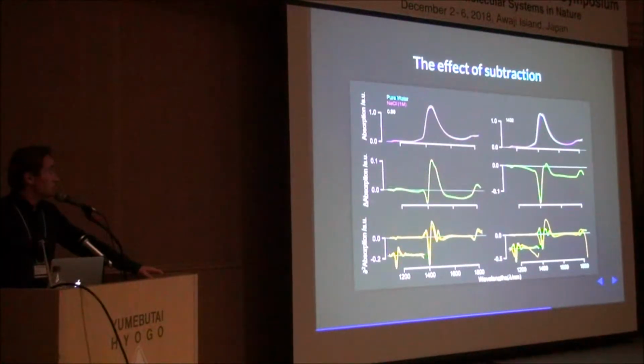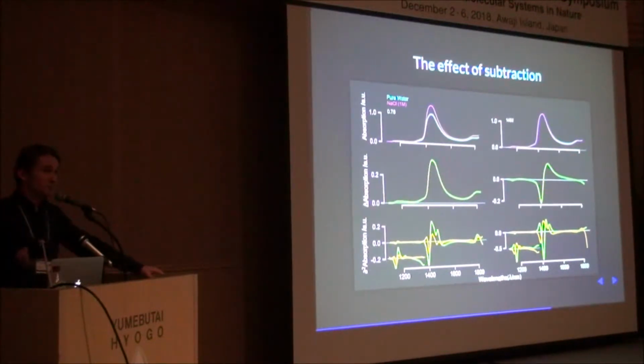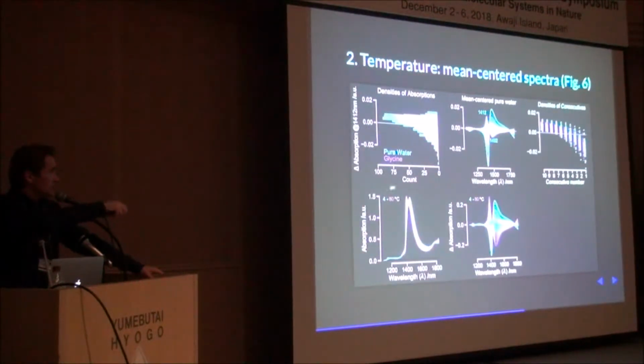So now I'm coming to the point of what we did. We decided to generate a database of spectra that I already showed you. So we generated a database of several thousand spectra between 4 and 80 degrees.